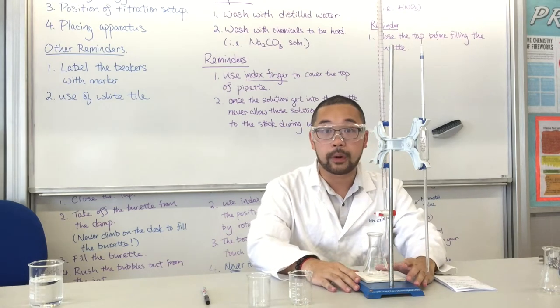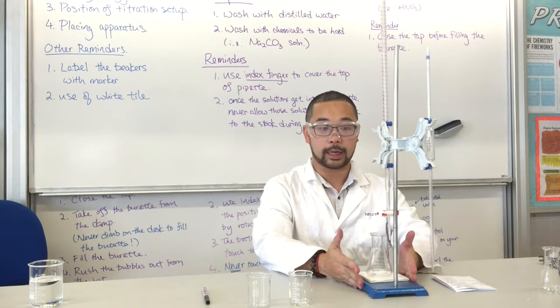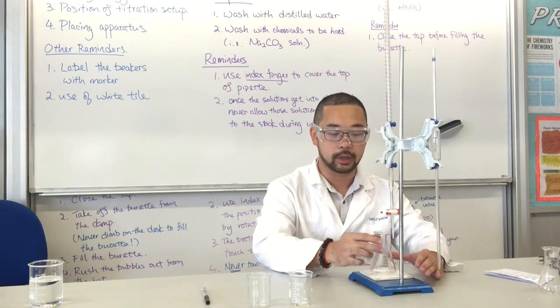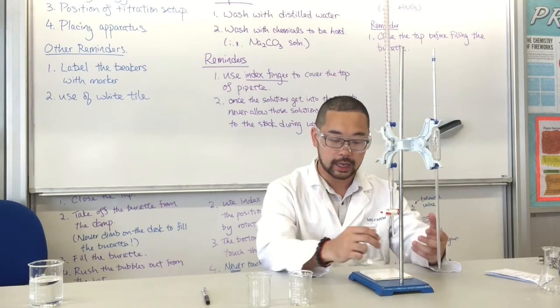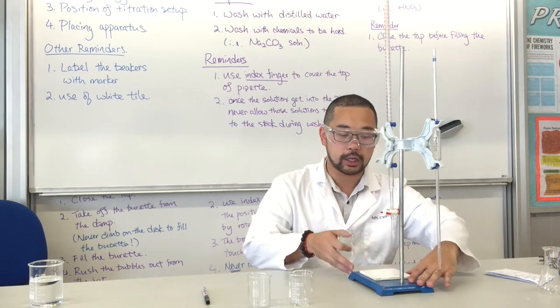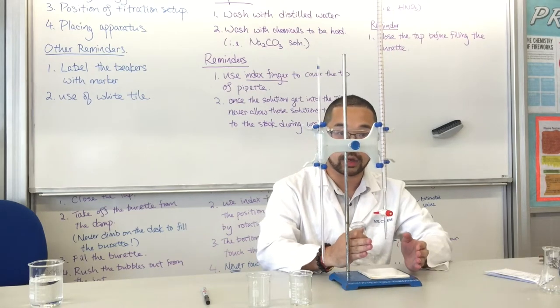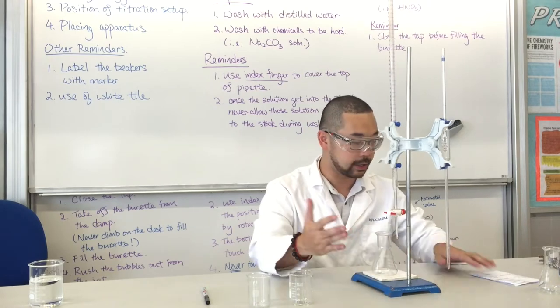And the third one will be the position of the titration setup. So you should see that, right now, the titration stand and clamp, the stand right here, will be at the back. When you're performing the titrations, your conical flask and your left hand and right hand should be clear. You should not have the stand either on the left hand side or on the right hand side, because when you perform the titration, it will completely block your activities.